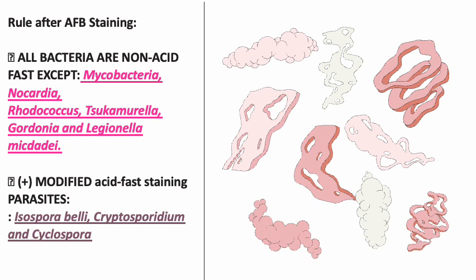Modified acid-fast staining is the modified Kinyoun method, which turns positive for parasites.